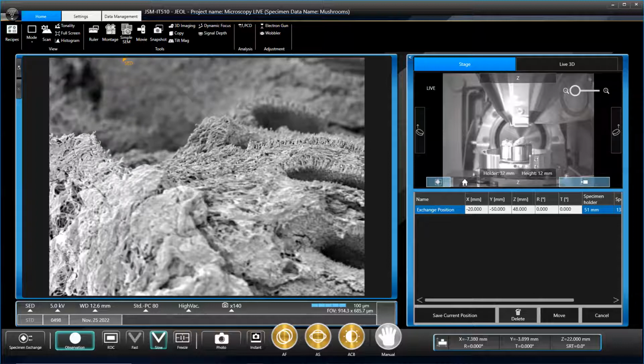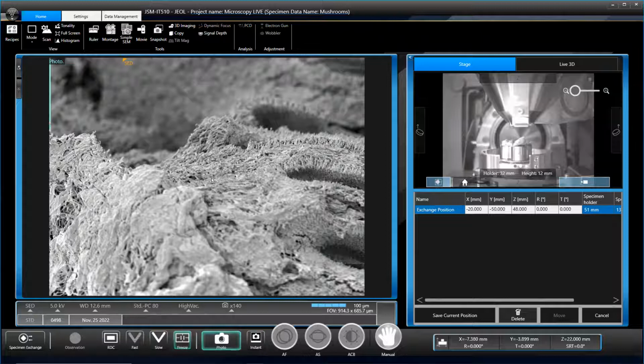This is the edge of the gills there, going into what I'm going to call the fleshy bit. I guess that will be going into the cap. So kind of looking at the underside of it. The inside of the gills, like kind of outside in terms of the structure. So it looks like it's a bit longer in the middle. Can you see what I mean?